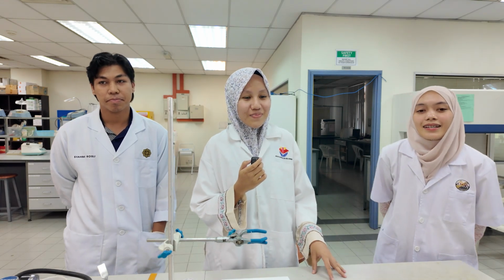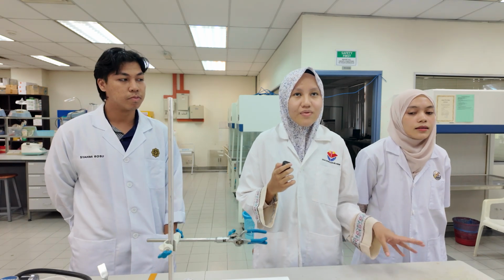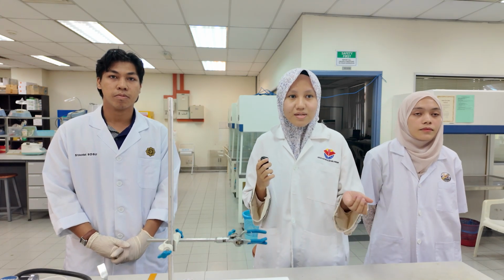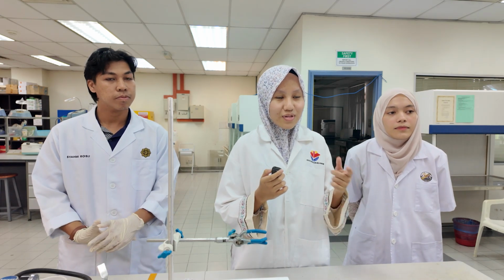Okay, first and foremost, I will explain to you guys about recrystallization. Recrystallization is a purification process used to remove impurities from a solid compound by dissolving it in a suitable solvent. For example, do you guys know an example for the suitable solvent? No? Alida, don't know?